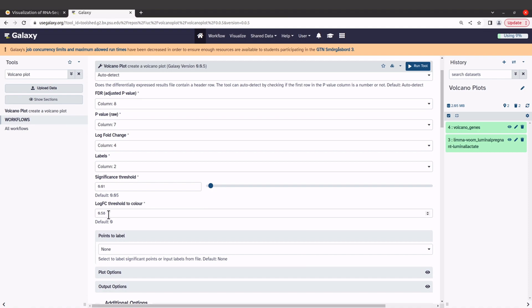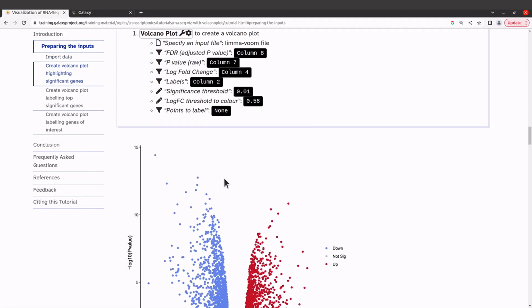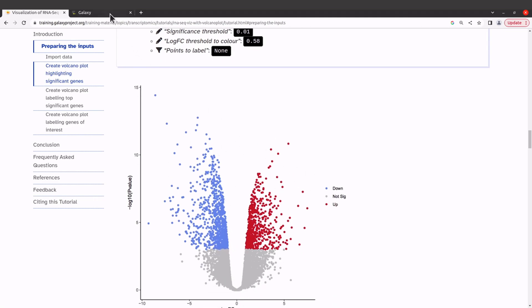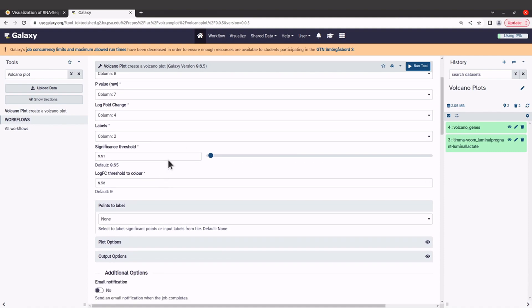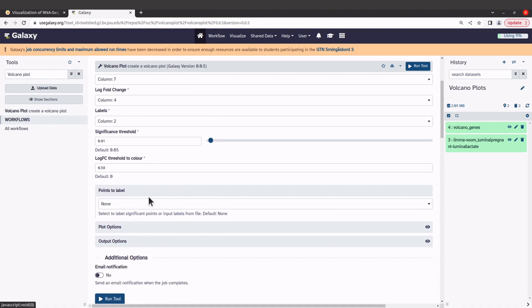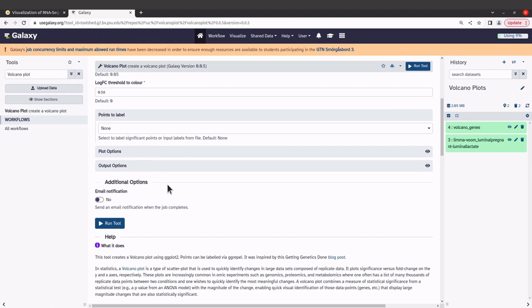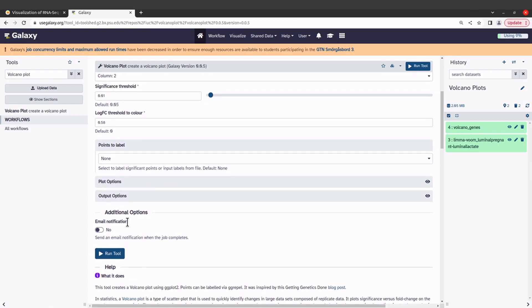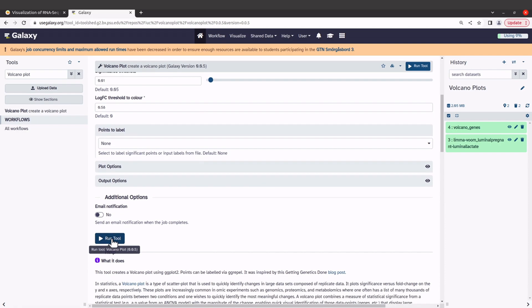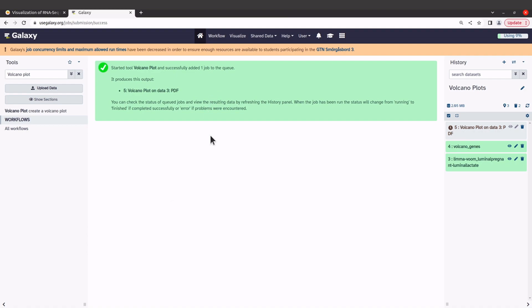For 'Points to Label' we select 'None' for this first plot — we just want the generic volcano plot without any gene labels. We've now specified all the necessary parameters, so click 'Run Tool'. Once you click it, the job will be submitted and an output will appear. Wait for Galaxy to complete the job; what will be generated is a PDF file containing the plot.